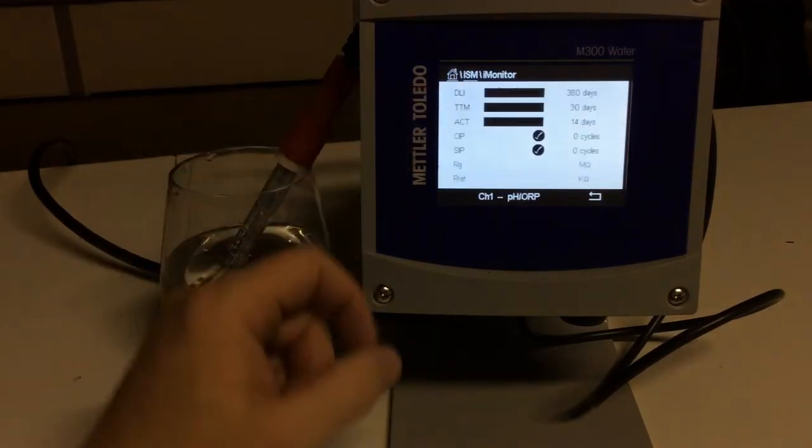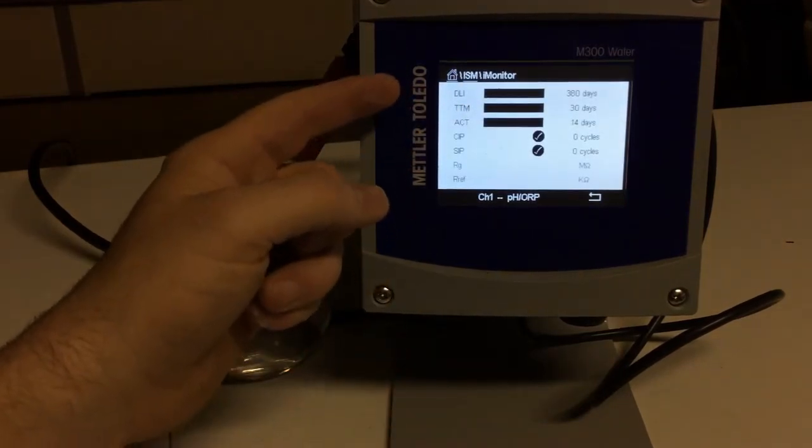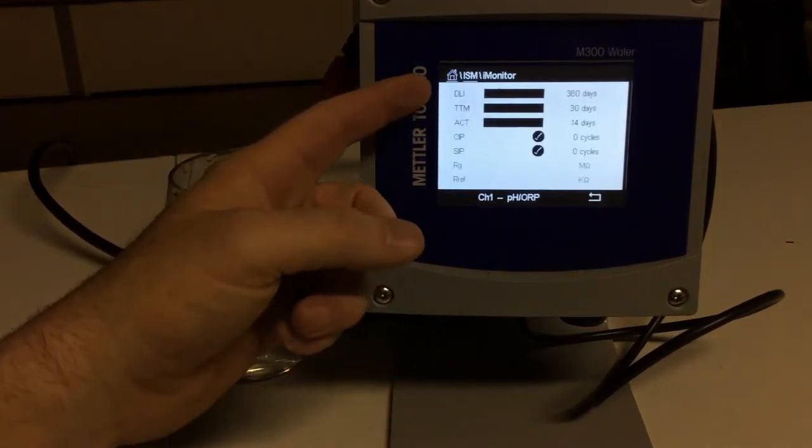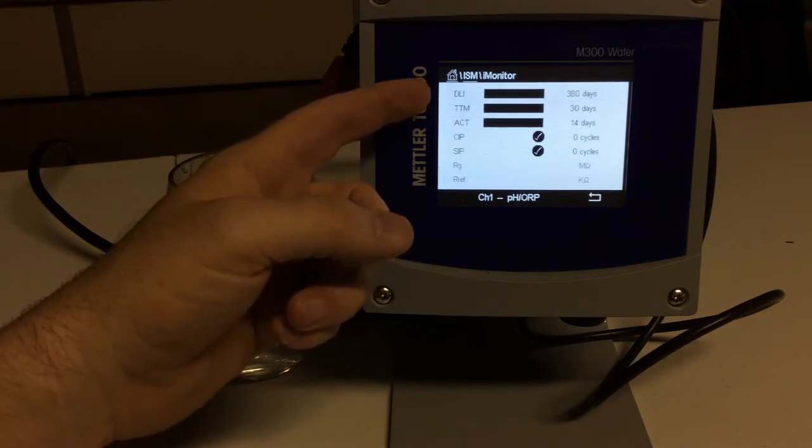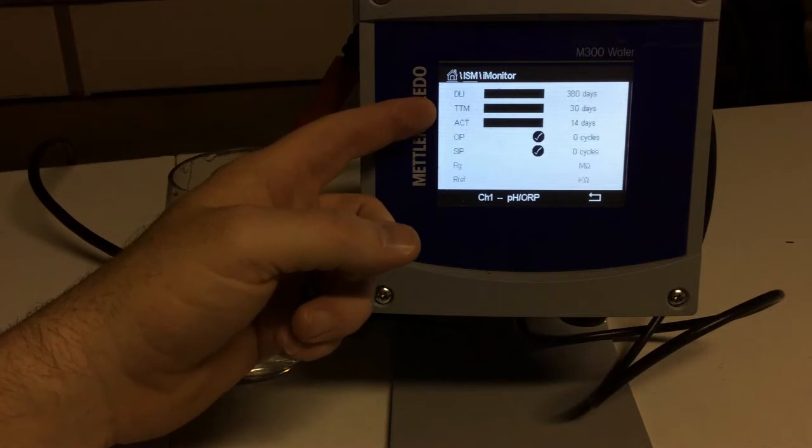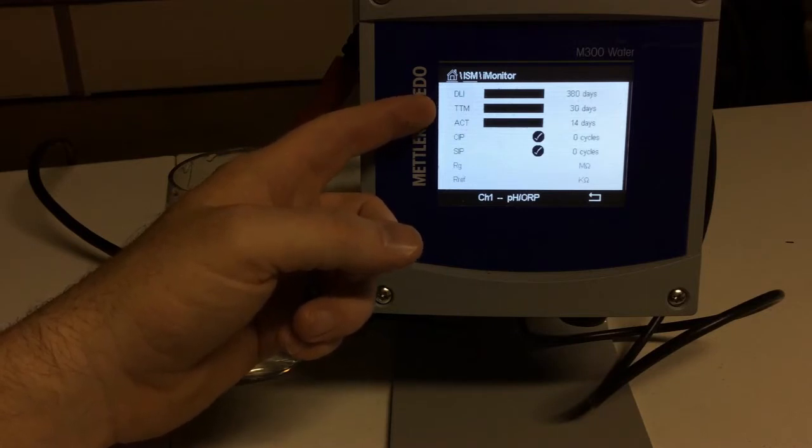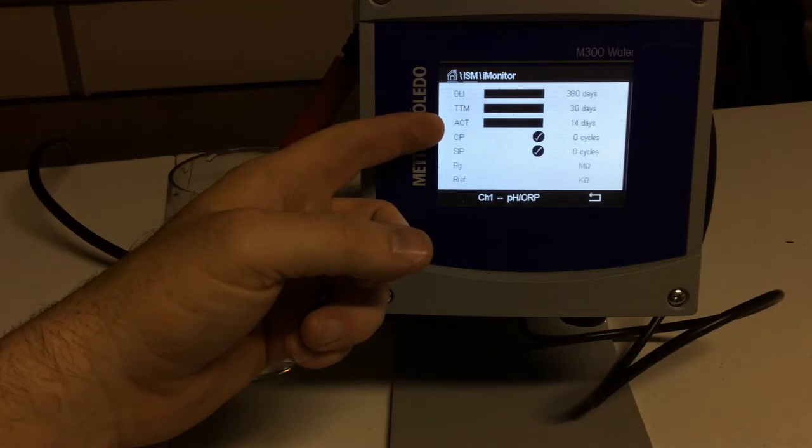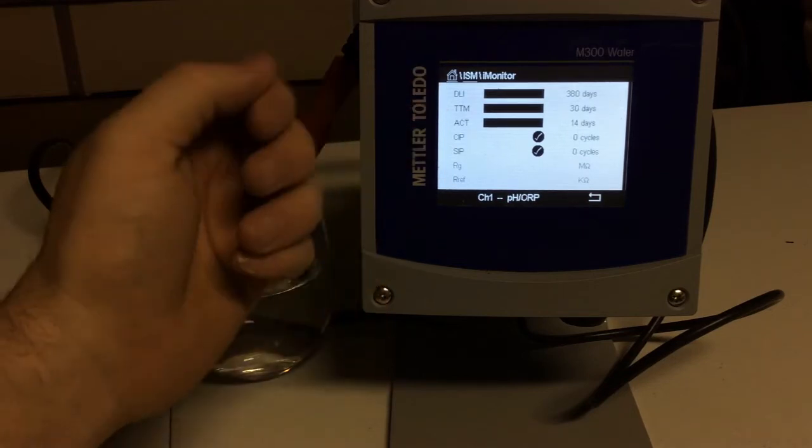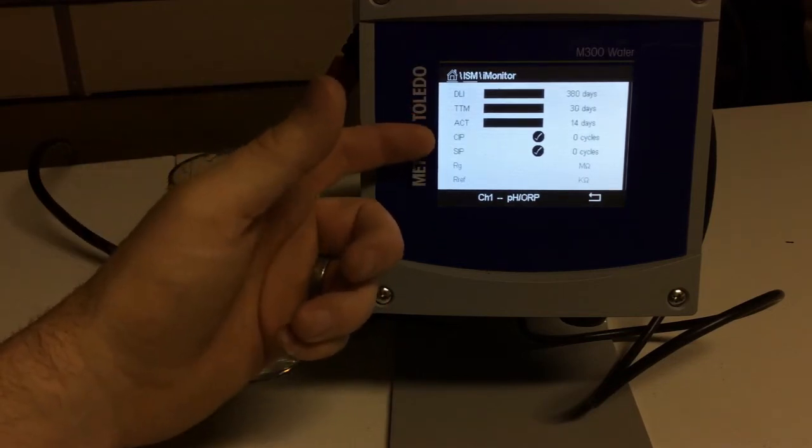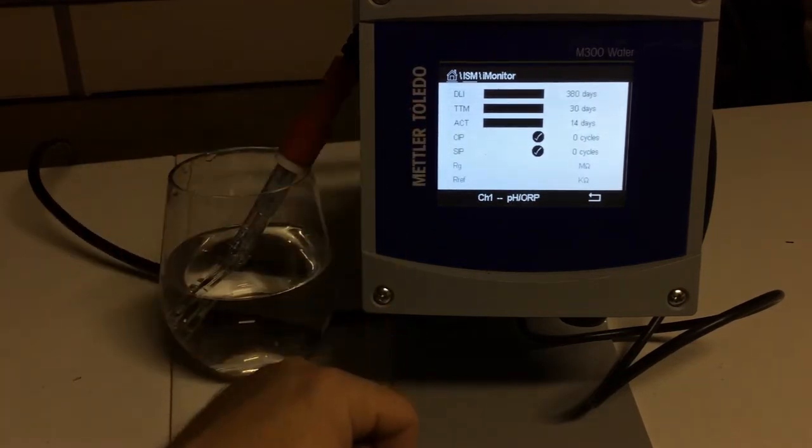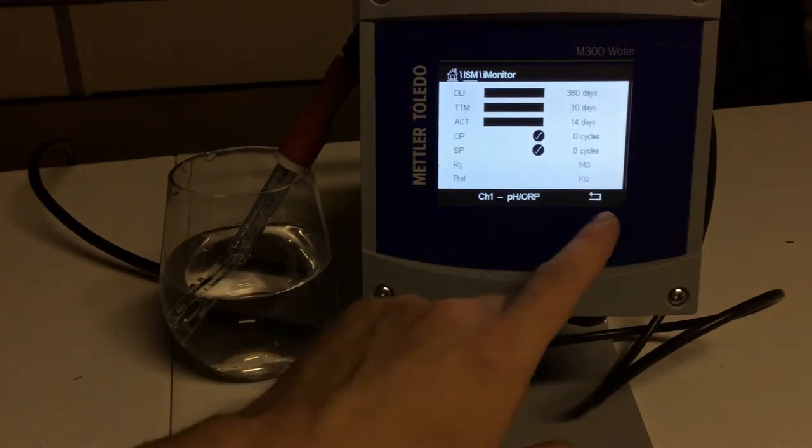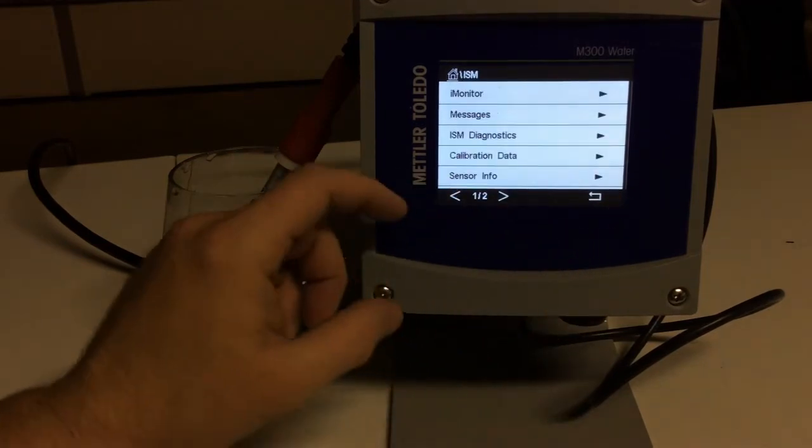If we go to iMonitor, this is where we find out the life of our sensor. So, DLI is Dynamic Lifetime Indicator. This sensor is still good for 380 days. TTM is time to maintenance, it's 30 days away, adaptive calibration timer is at 14 days. So, everything looks good. The CIP and SIP, that's clean in place, steam in place, and we're looking good there. So, you can monitor your sensor for its health.